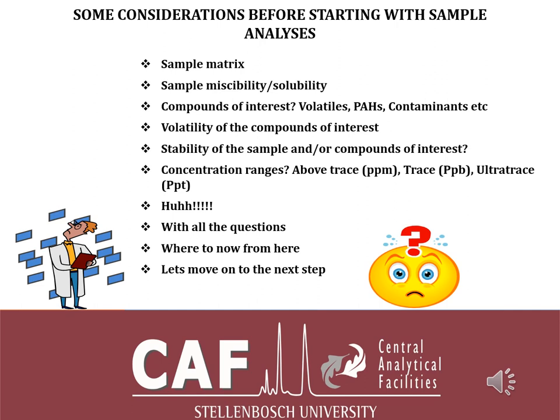And if it's a contaminant, what type of contaminant are you talking about? Is it a sulfur-based contaminant, or is it a chlorine contaminant? For example, maybe trichloroanisoles, or is it phenolics, or halophenols?